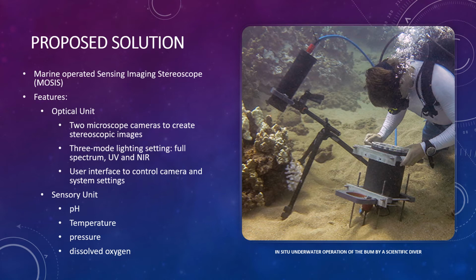The integration of sensors into the microscope is aimed at reducing the percent of human error in experiments conducted in the marine environment, where portable means of imaging and frequent water sampling are needed. By automating part of the sampling procedure and sampling sensory data along with image data, the imaging device can provide a stable means of observing and correlating small sessile benthic organisms in their natural environment without removing them and altering experimental results.